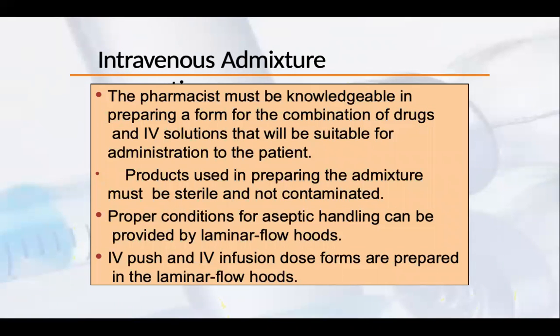Pharmacists must be knowledgeable in preparing the combination of drugs and IV solution that will be suitable for administration to patients. Products used in preparing admixtures must be sterile and not contaminated. Proper conditions for aseptic handling can be provided by laminar flow hoods. IV push and IV infusion dose forms are prepared in laminar flow hoods. A pharmacist who is going to prepare an intravenous admixture must know how to prepare the IV solutions.